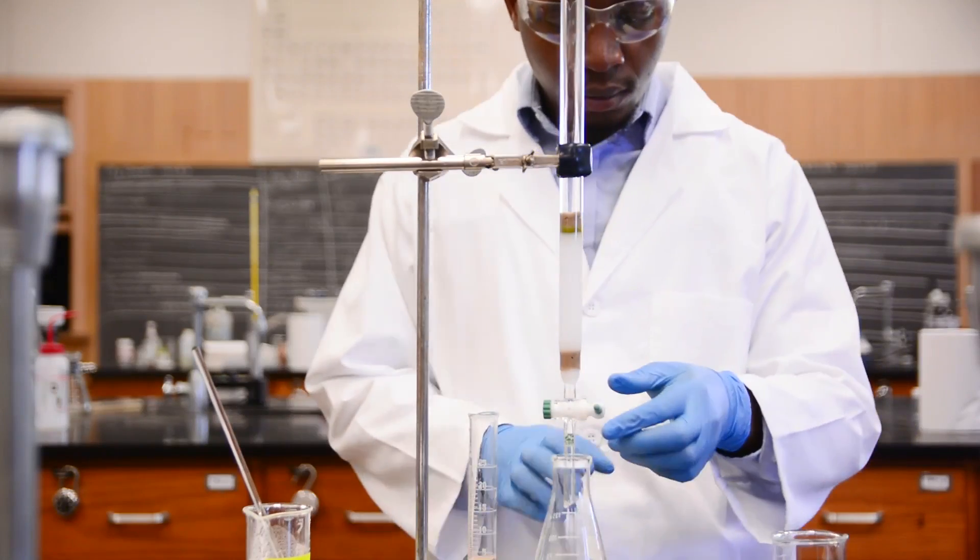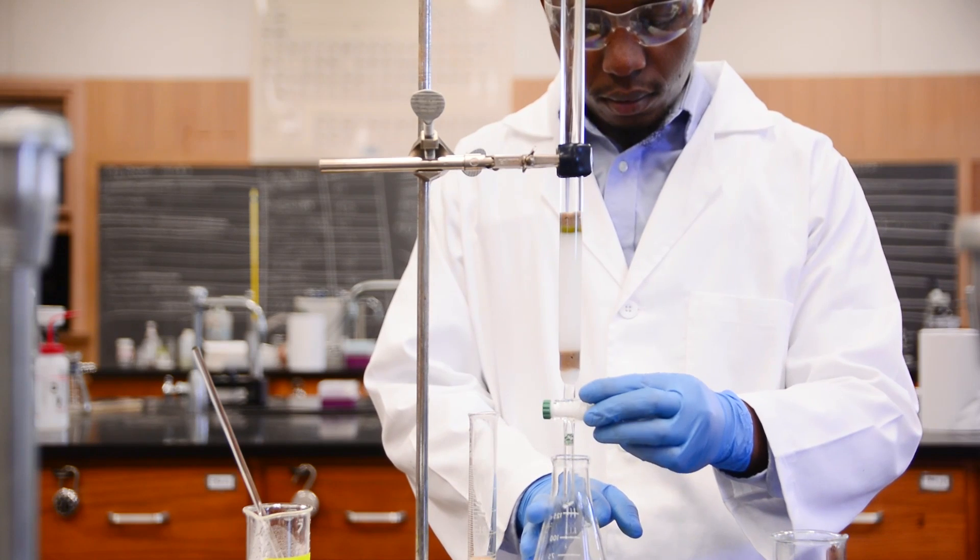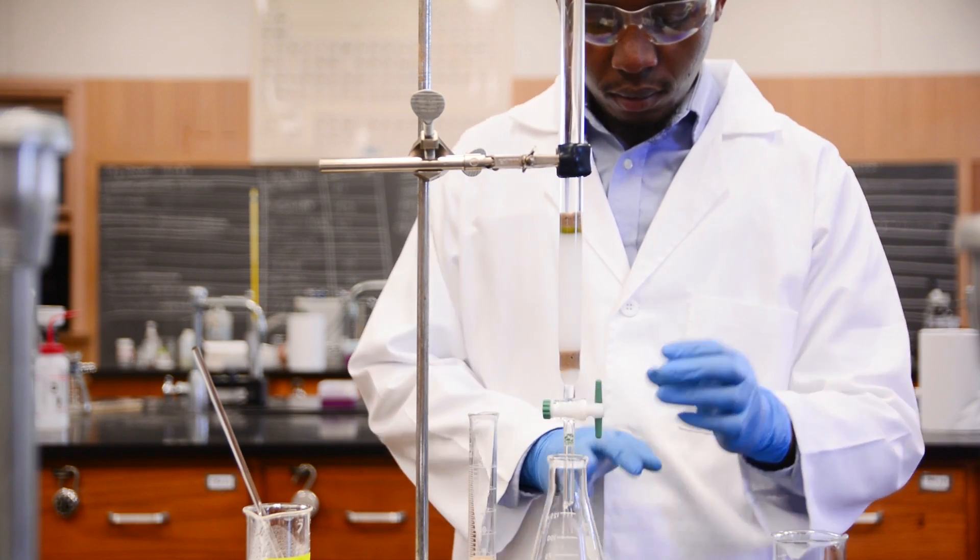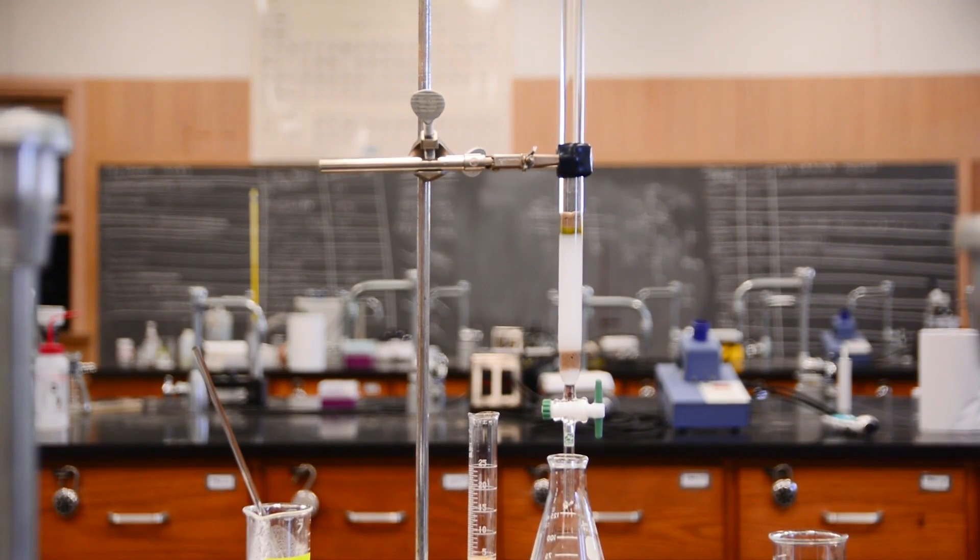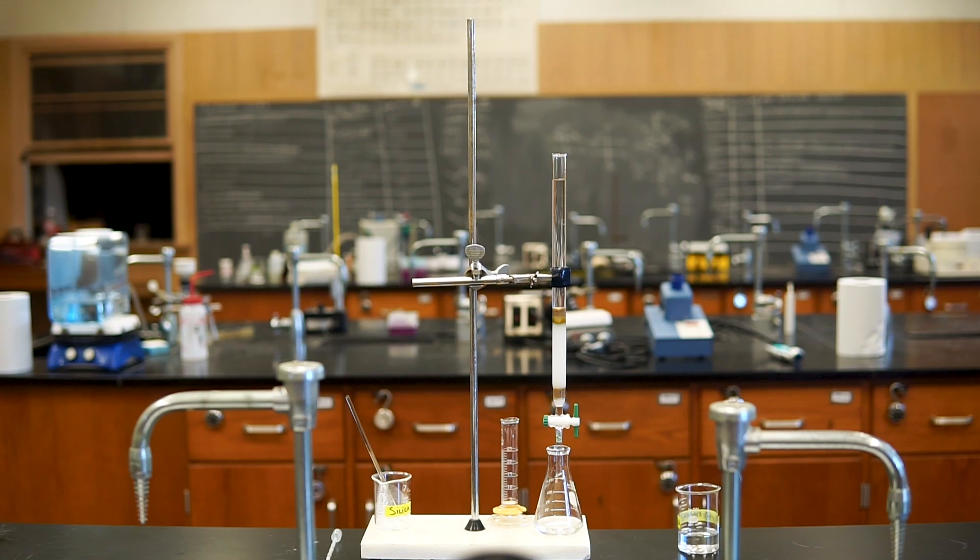We're now ready to run our column and collect the fractions. Let's open the stopcock. We don't have to start collecting fractions immediately as there is no way for our compounds to immediately be exiting the column, but soon after beginning you will want to begin collecting fractions in numbered vessels. Typically these will be small Erlenmeyer flasks, but today we will be using test tubes. Start collecting and just move to the next one whenever the current one is full, or sooner if you think that a new substance is about to exit the column. It is very important that you monitor the solvent level as you collect your samples.